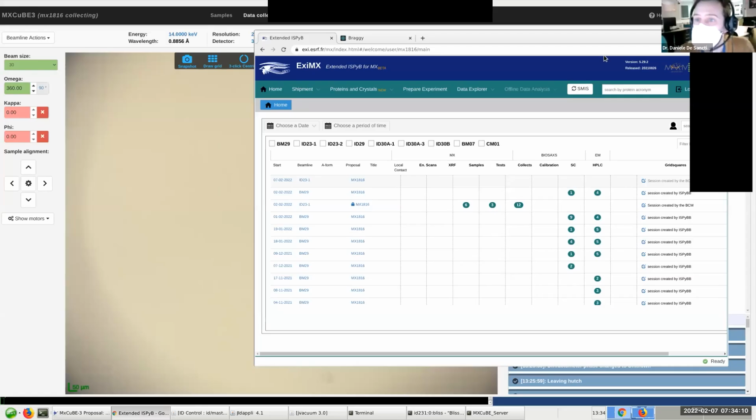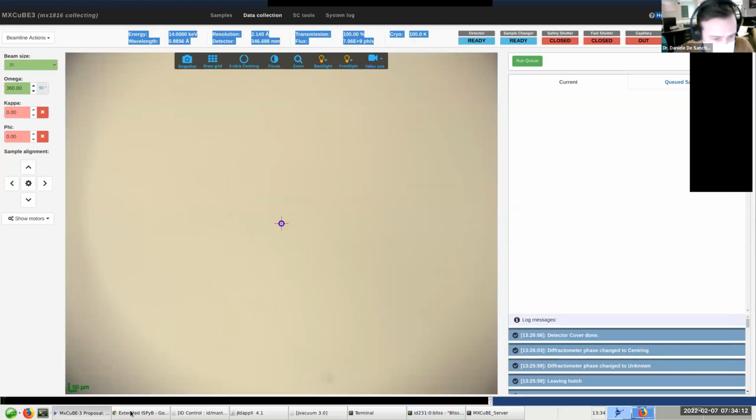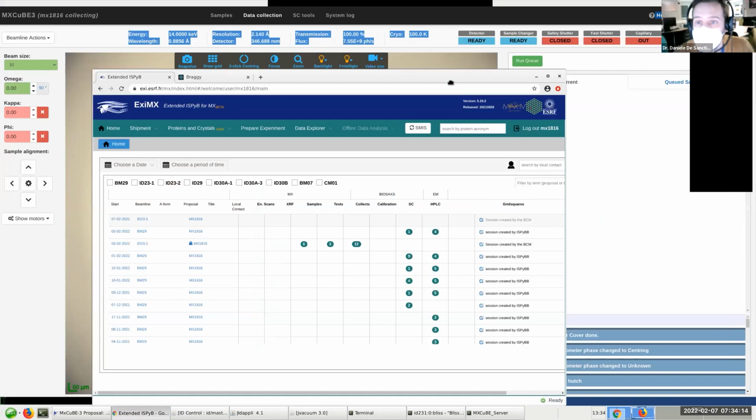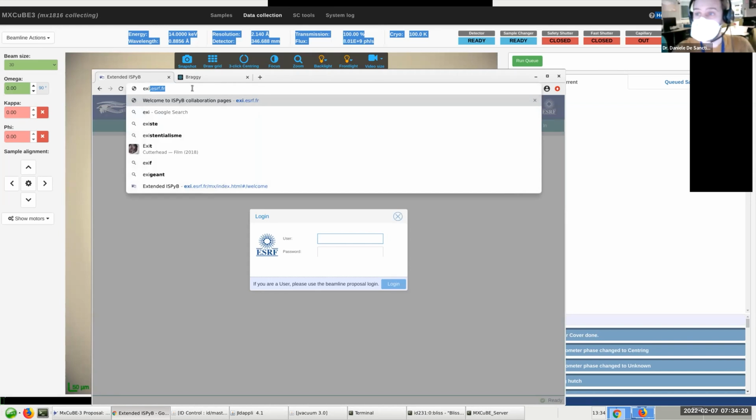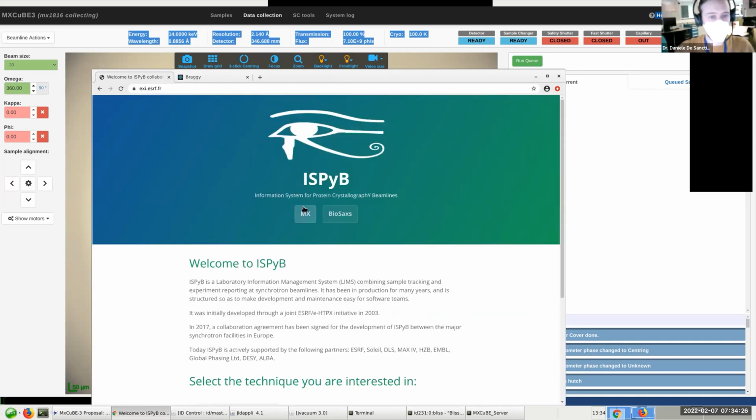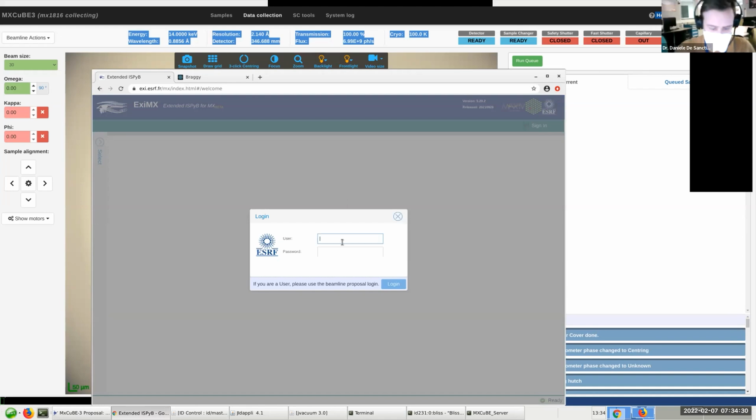So I will share my desktop now. Here. Okay, so let me just log out so that we can start from scratch. So usually at home, when you want to use ISPyB, you go to EXI, the extended ISPyB interface, at exi.esrf.fr. We are on MX experiment today, so we just click on MX and I will log in with my proposal name. This is still true and it will be true for a while.